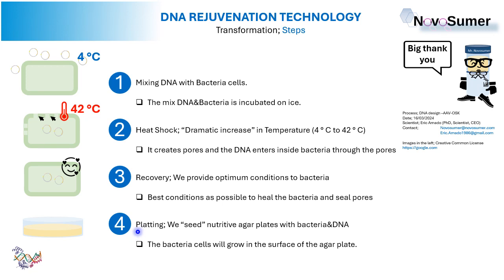It's just seeding the plates with the sample that we recover from here. So we seed nutritive agar plates with bacteria and DNA inside. The bacteria cells will grow on the surface of the agar plates.